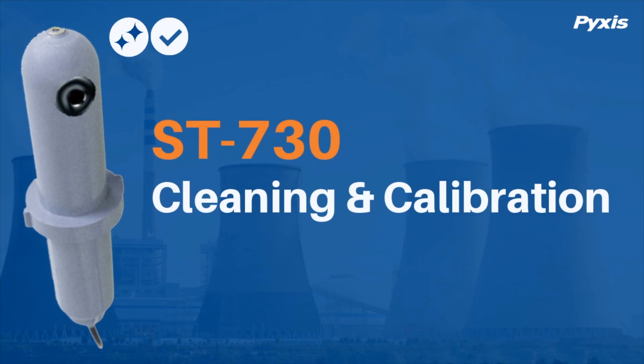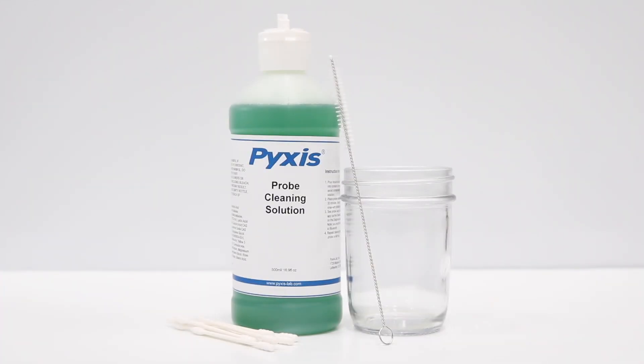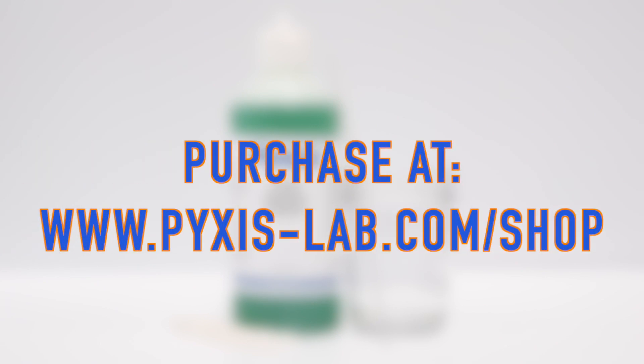This video demonstrates the procedure for cleaning and calibrating the ST730 inline turbidity sensor. To complete this procedure, you will need the Pixis Probe Cleaning Kit, available on pixis-lab.com.